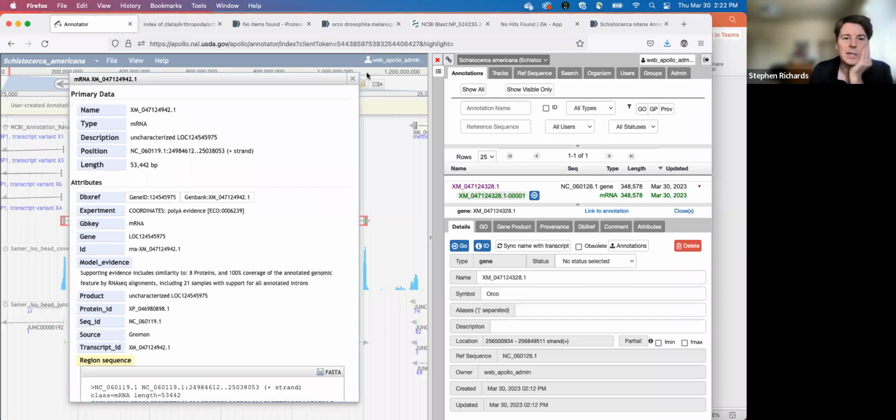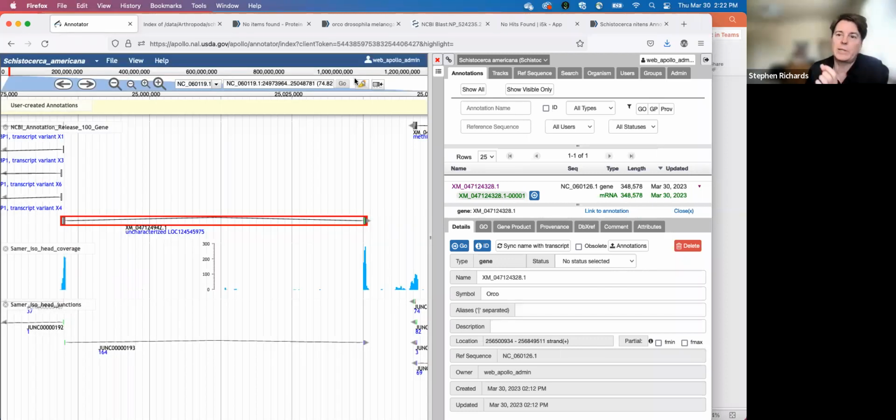I wish I could say something more useful, like perhaps if we blast the genes either side, you might be able to at least find orthology to other species, but I think everything's too far away for that to work. And even if you do, you've got genes of unknown name and unknown function in multiple species, which isn't more useful. It's just a bigger pile of questions.